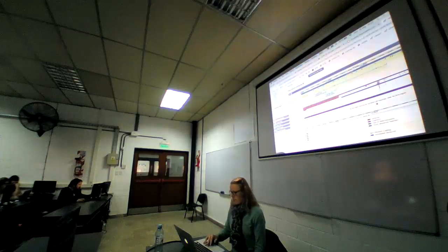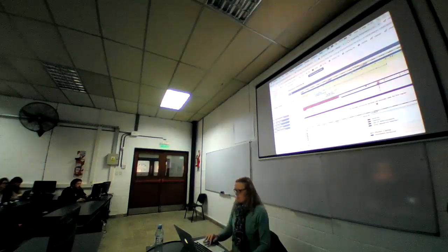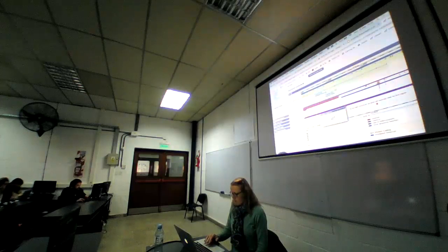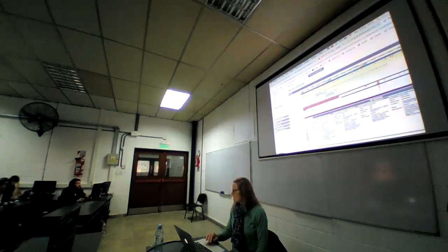In contrast, for the larger structural variants, we condense multiple ones into one of these blocks. So this purple one here is a copy number variation. If you click on that, you will see that this has been described in 20 different studies, which we don't show separately. And yeah, they are linked out to PubMed.